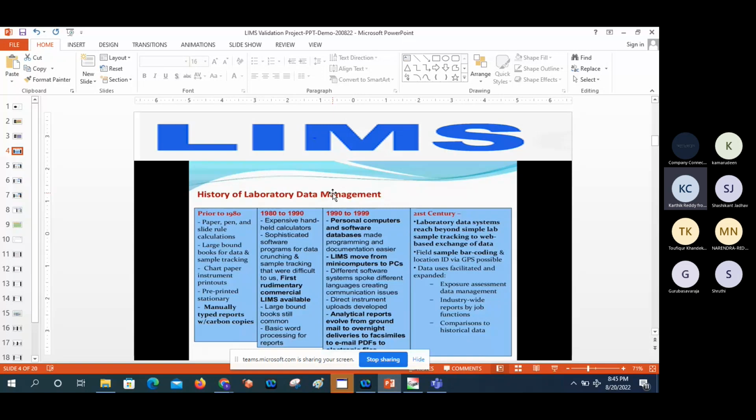So they approach the vendors that currently play the major role in the market, like LabVantage LIMS, Thermo Fisher Scientific LIMS, BioVia LIMS, and LabWare LIMS, and Caliber LIMS. Many domestic organizations are also involved.